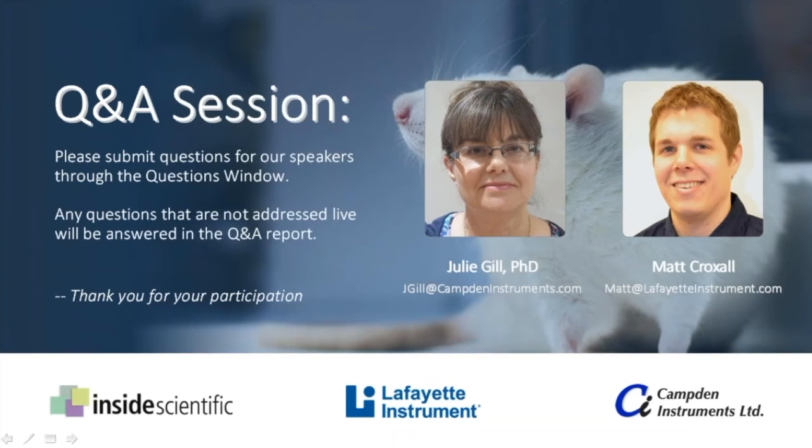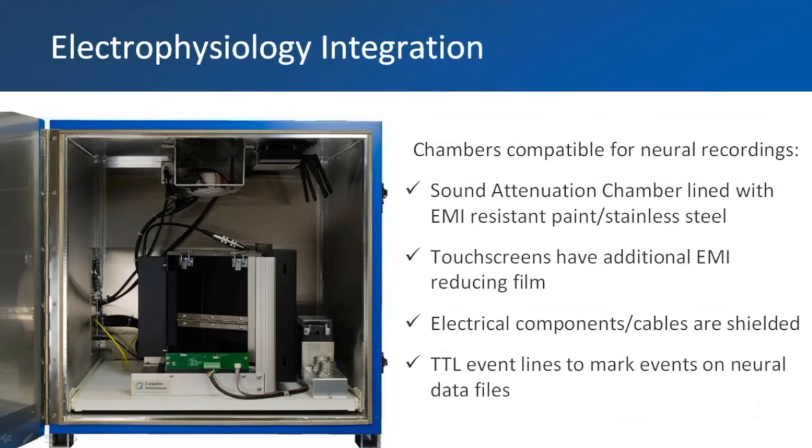Yes, Martin, absolutely. It's certainly a question that comes up quite often, and there's quite a bit of information that we could provide on this. We could probably do a whole other seminar just on integrative approaches. But I've tried to summarize a few points here specific to electrophysiology and optogenetics. For electrophysiology integration, we do have chambers that are compatible with third-party neural acquisition systems from any of the main neural companies. These chambers have some specific features which make the recording of neural data a lot easier.